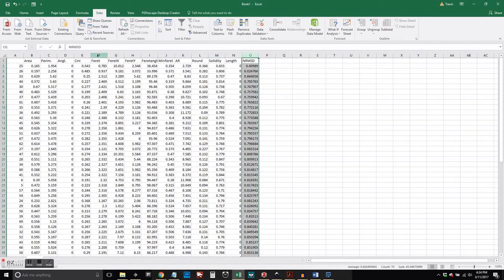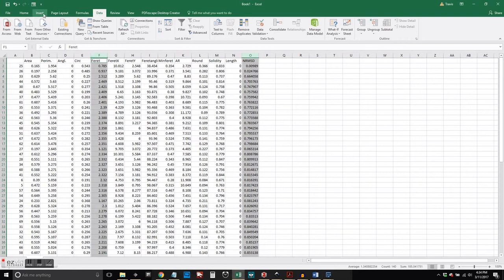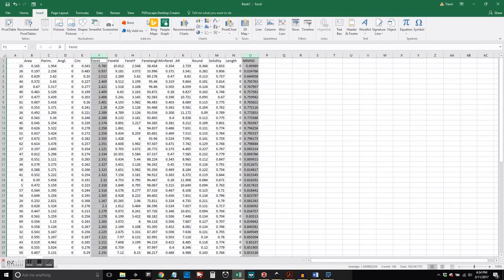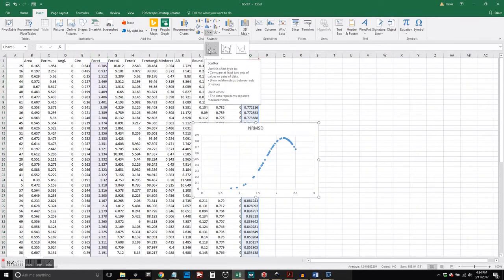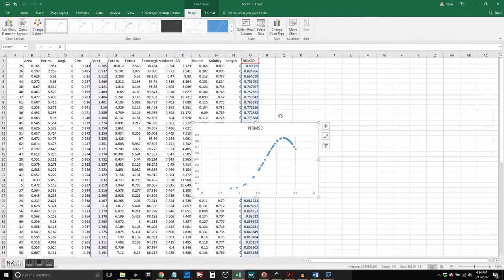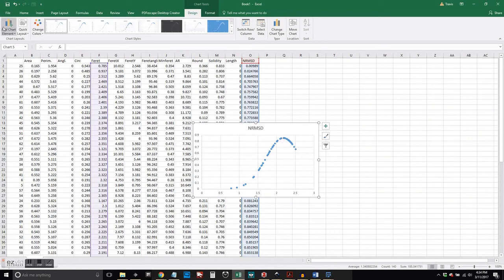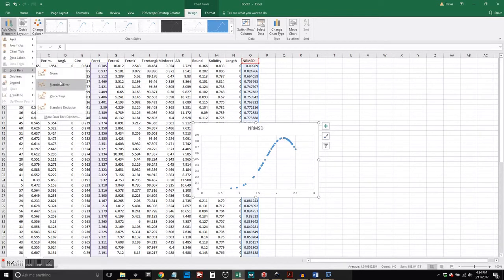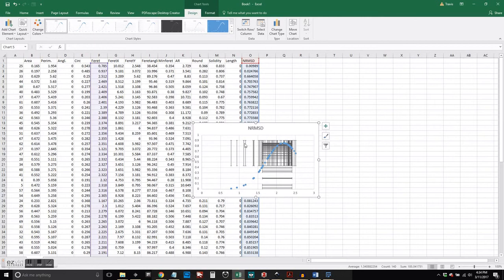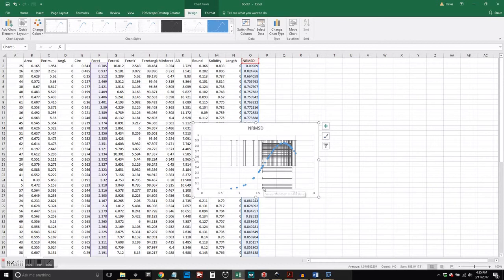And we're going to use O and F columns. So my ferret data, which would roughly equate to my length, and my normalized data. And so we're having Excel create the normal distribution for us. And you can see this beautiful bell curve created by our data.